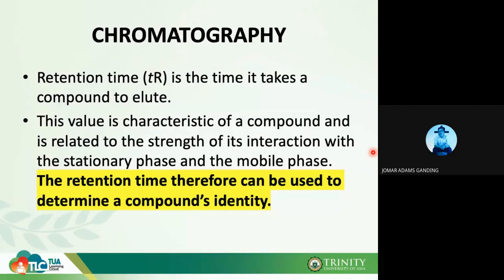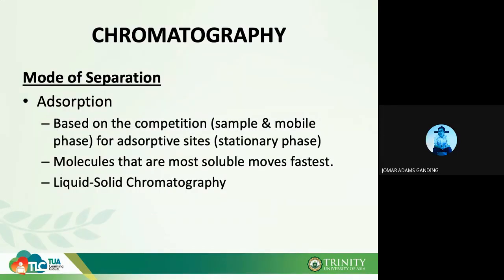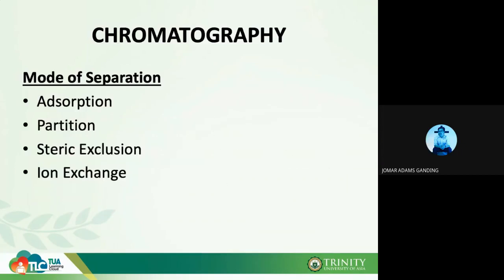So later on, the different chromatographic techniques actually differ on the mobile phase rather than the stationary phase. We have gas chromatography, we have liquid chromatography. I'll explain that in the succeeding topics. Let me just finish this first. So, in chromatography, we have modes of separation. First is adsorption, then partition, steric exclusion, and ion exchange. Let me go first to adsorption.